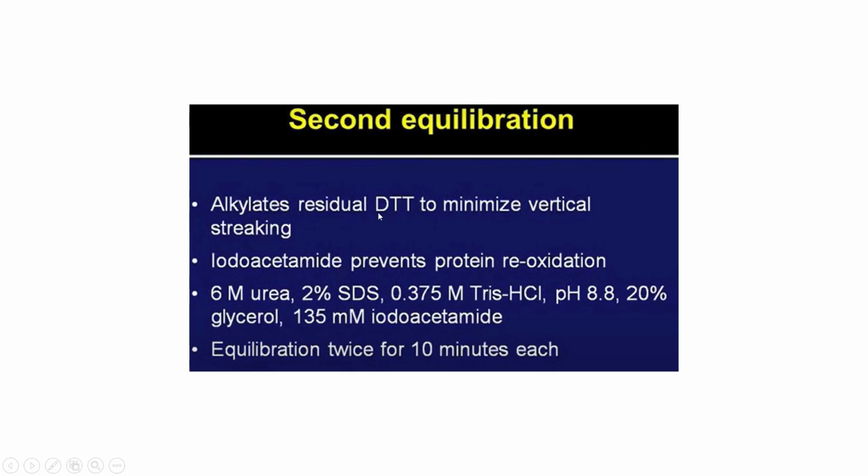If you are not doing this, you will have a streak of proteins as they get separated. You'll not get separate bands, and you'll be unable to determine what the protein is and what its molecular weight is, and it will be a fluff experiment basically.